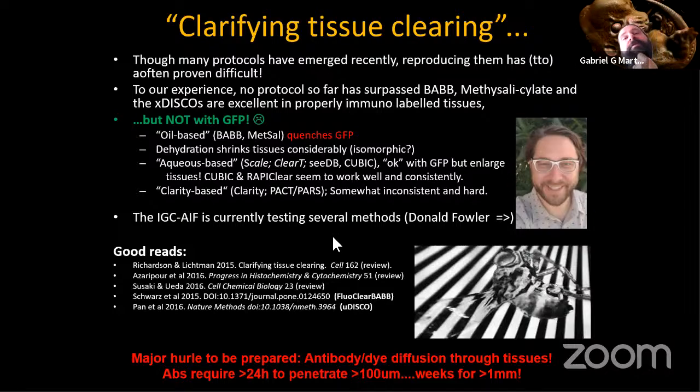And there is no simple solution that will work all the time. So this is one of the things that I invite you to talk to the people in your lab or any of us in your imaging facilities to try to come up with a good solution for you. Just know that this is not the kind of thing that you can do next week. It typically requires months of testing and optimizing things until you get it to work in your sample.